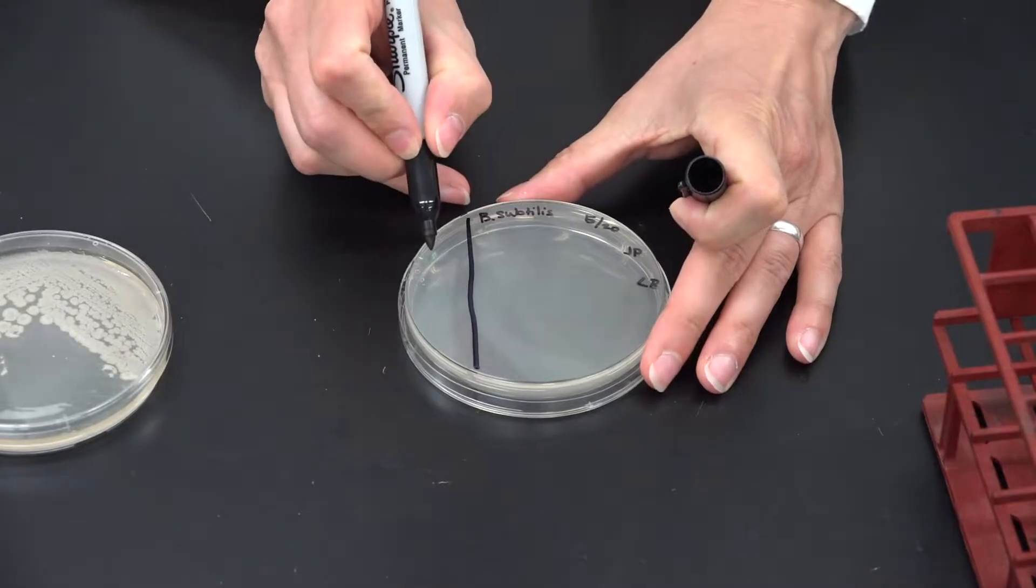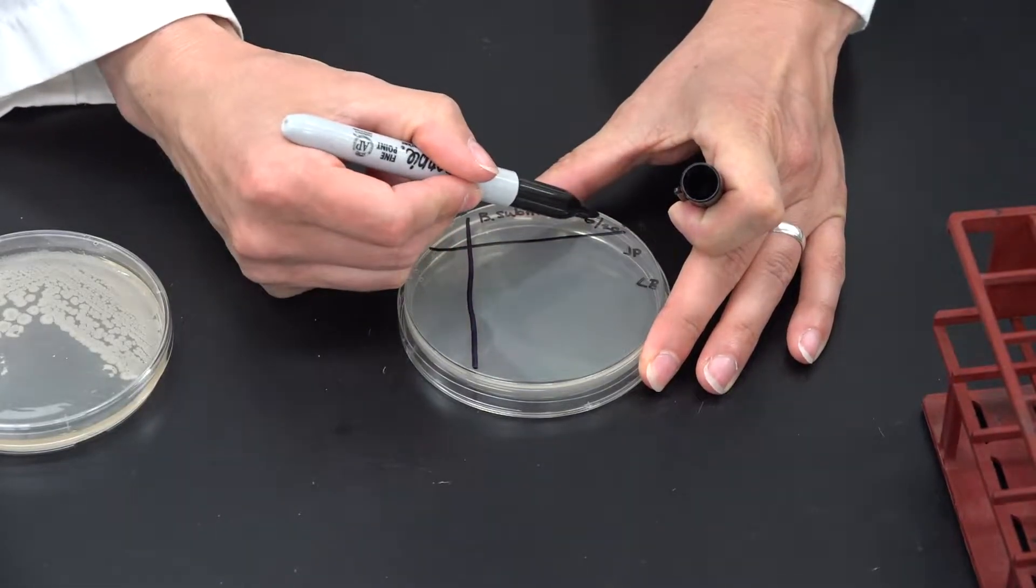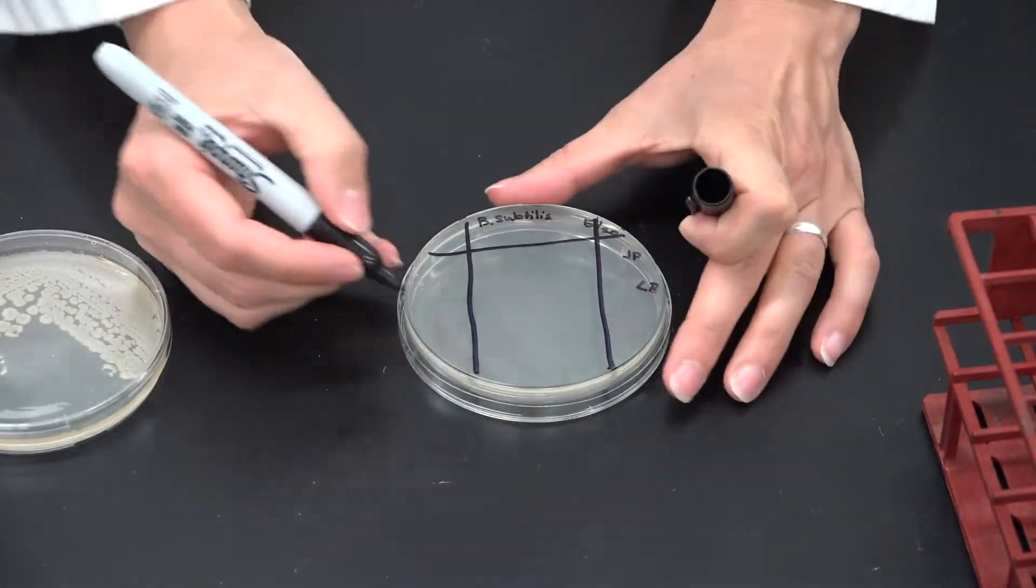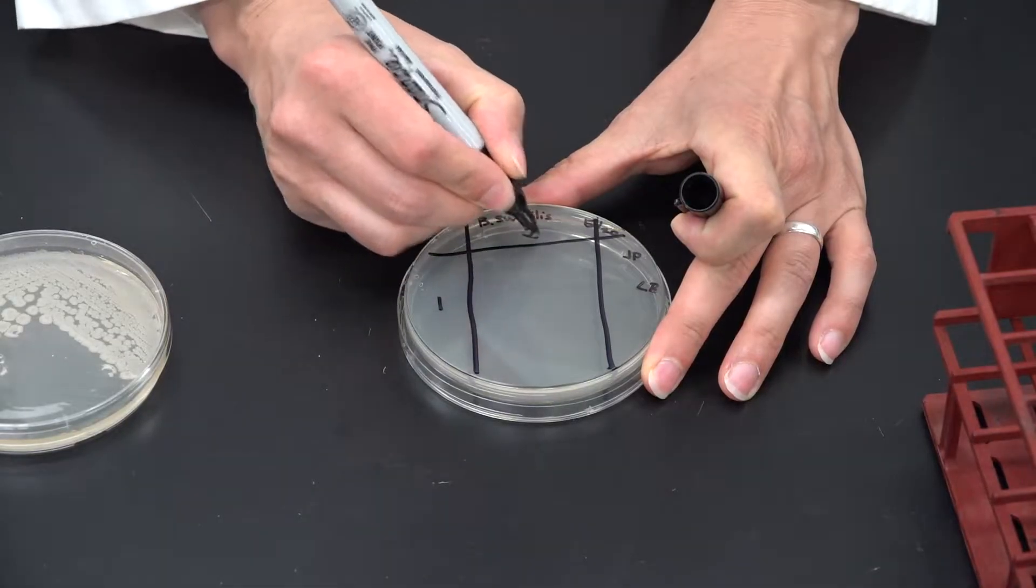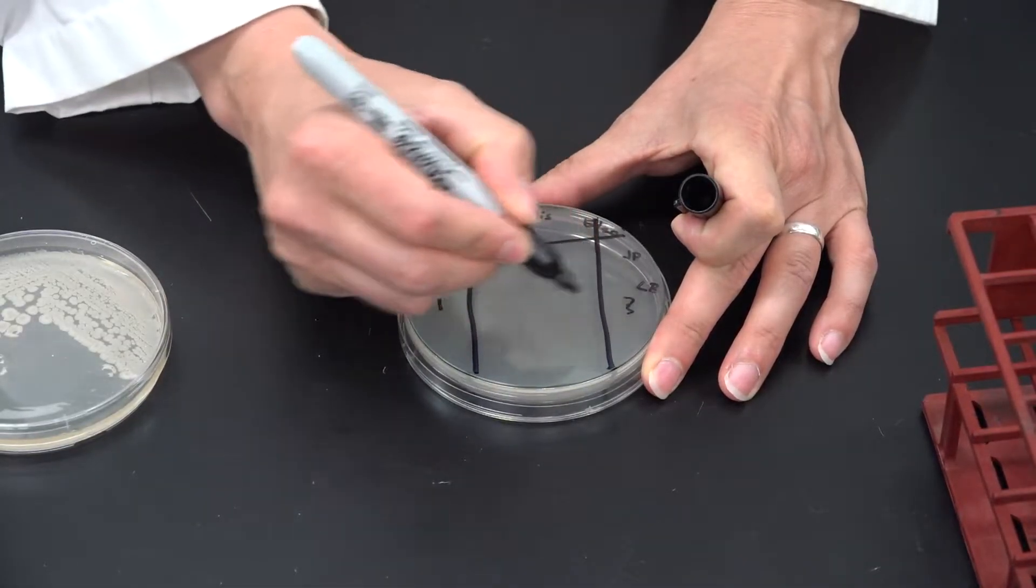On the back of the plate, take a marker and draw three lines, then label the quadrants as one, two, three, and four.